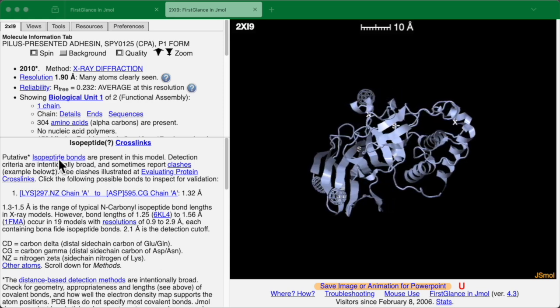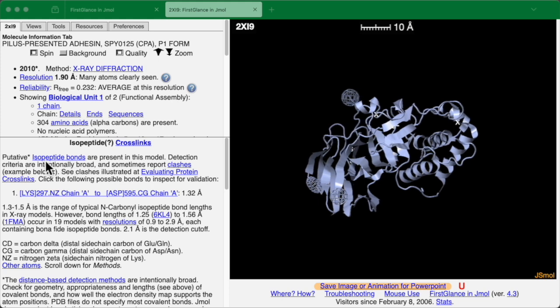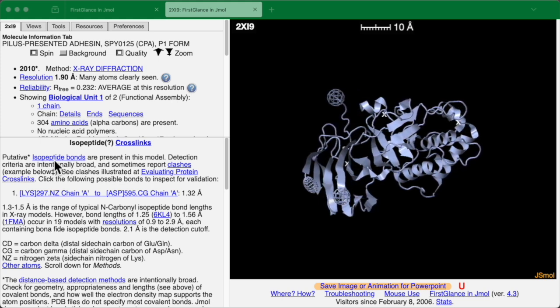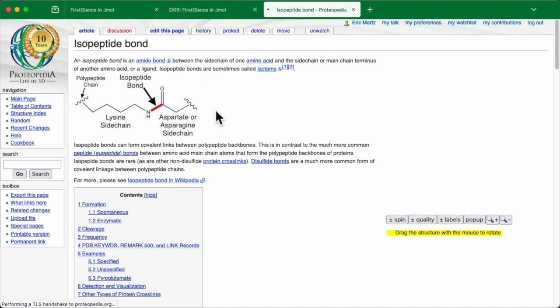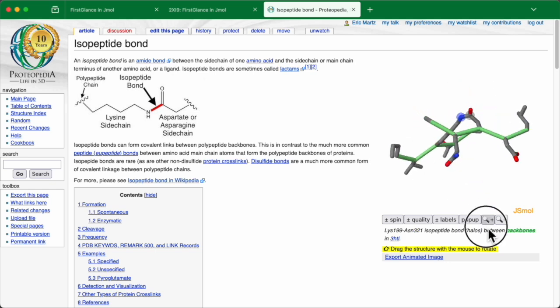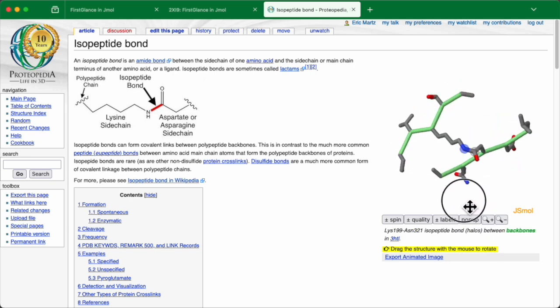If you'd like to review what an isopeptide bond is, click on this link here. This is typical of FirstGlance. There's a lot of explanatory information available. When you click on this, it goes to a Proteopedia page that shows you in chemical atomic detail what is an isopeptide bond and actually provides an interactive example over here.